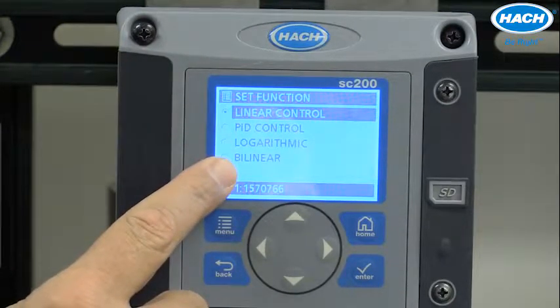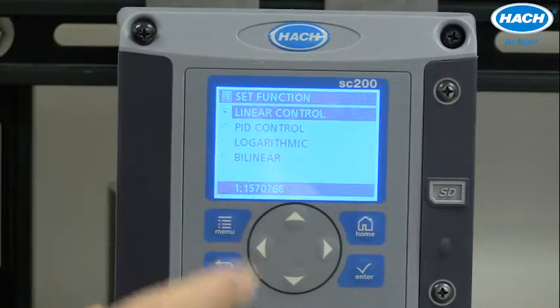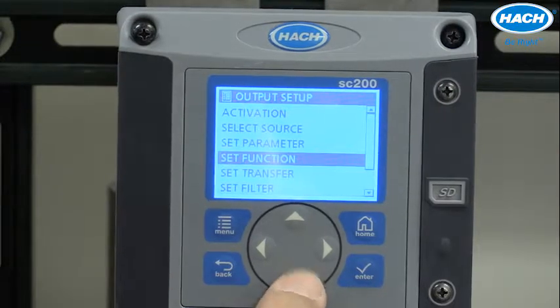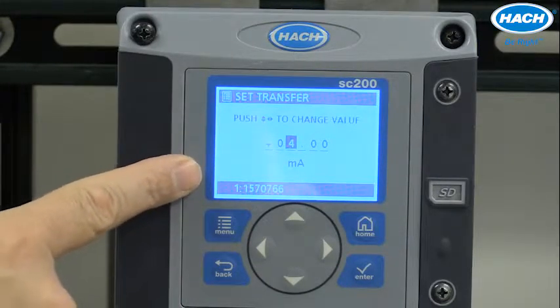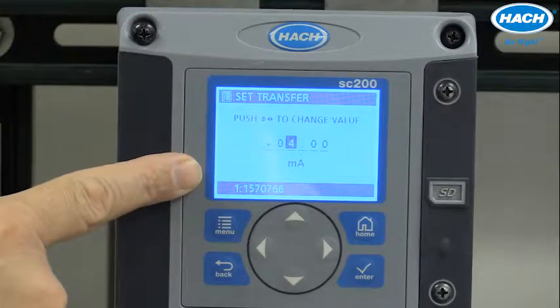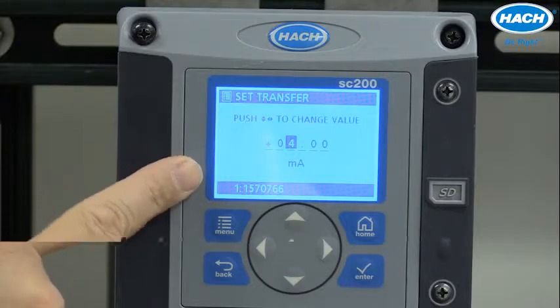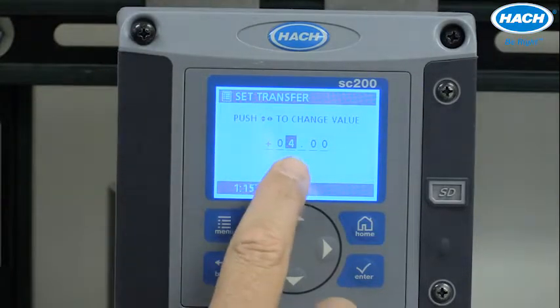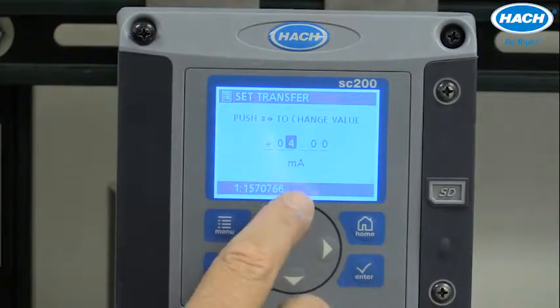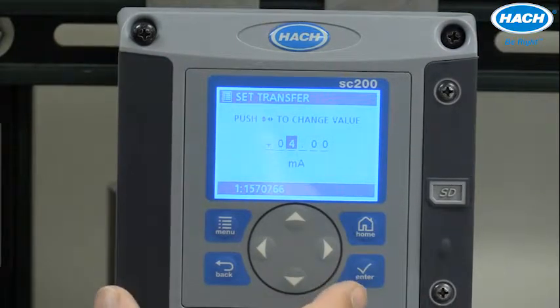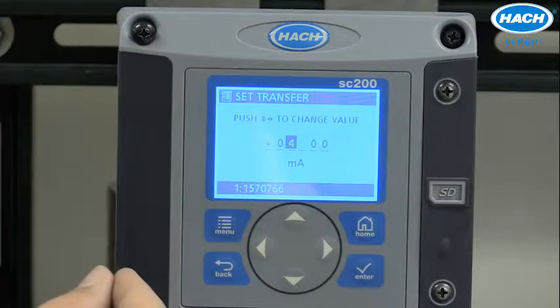These other three function options are available and further details can be obtained in the SC200 manual. Set Transfer provides the user with an optional output during maintenance and calibration. During those times, you can either hold outputs, keep the outputs live, or transfer the current to a preset value determined here. For example, you can always output 2 milliamps or perhaps 22 milliamps when the device is being maintained or calibrated.